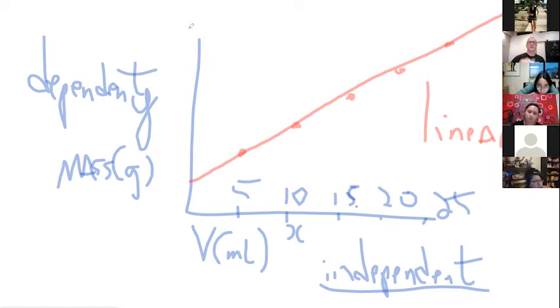Remember, when we get a linear fit, we get an equation that says y equals mx plus b. Remember, we did that with our graphing lab last week. Now we're finding out why we did that graphing lab last week, because we're going to use all those lessons we learned in an actual real life example here.